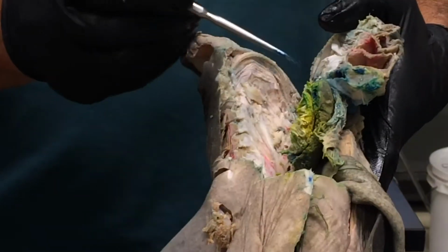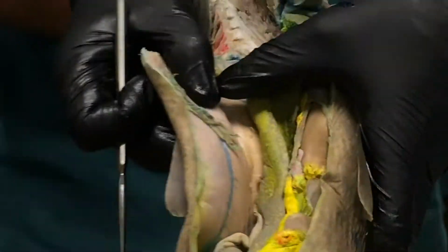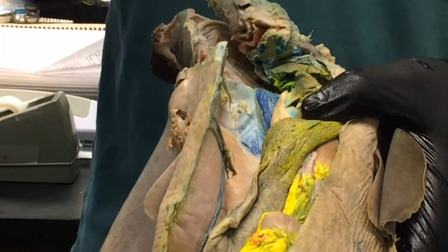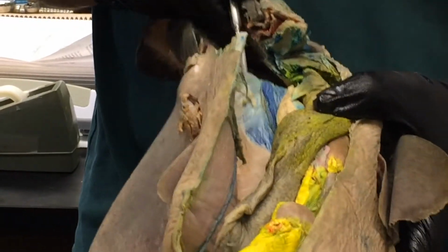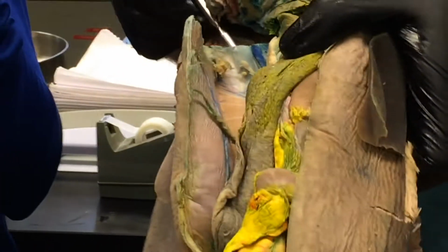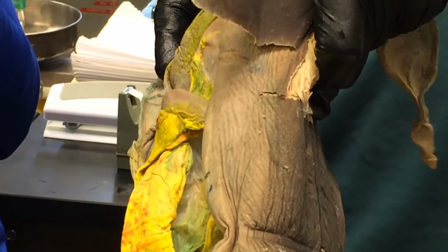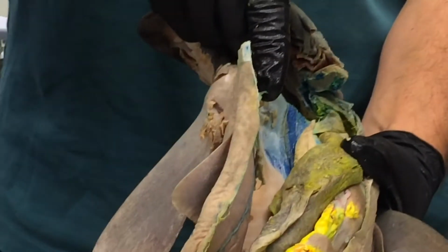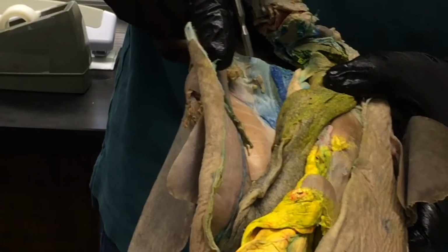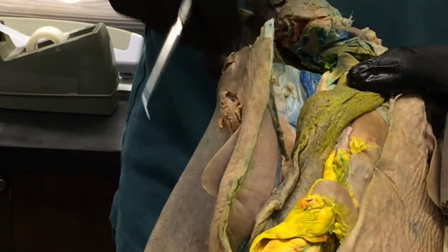Okay. So that's the common cardinal vein, and if we come then and look dorsally here, the common cardinal vein is right here, coming around like this. It's receiving blood coming in here from the posterior cardinal vein. The posterior cardinal vein is kind of expanded at its front end, and it's called the posterior cardinal sinus. Okay. You see that at all? All right. Yeah. All right. So pushing it forward, you get to the anterior cardinal vein? So we're getting there. Okay, so that's the posterior cardinal vein.